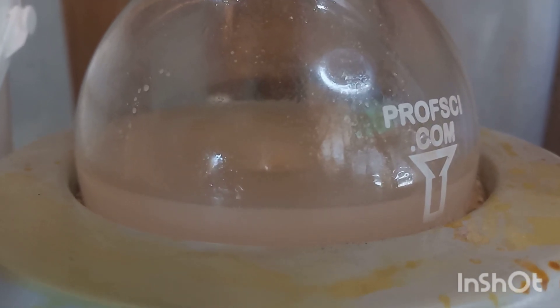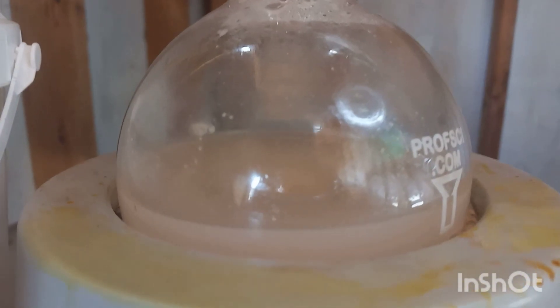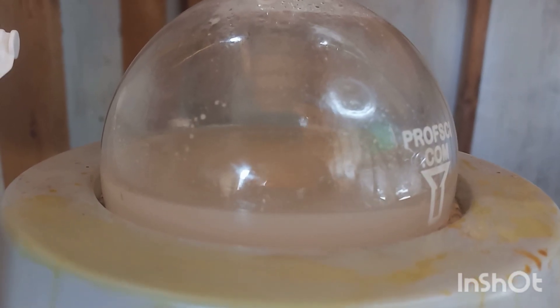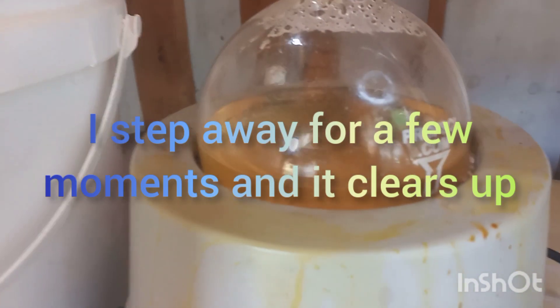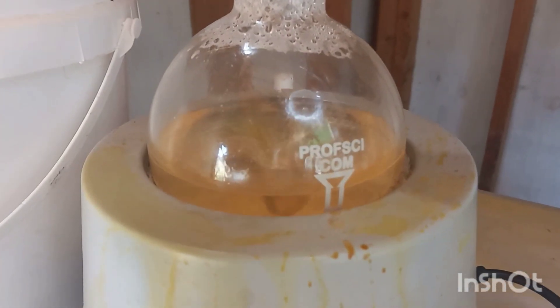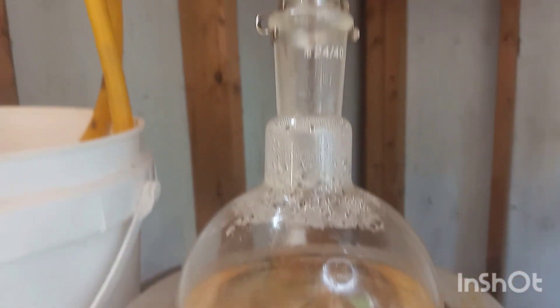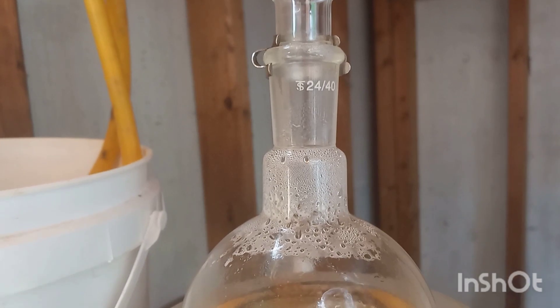We've got up to about 60 degrees. We're getting some reflux — it looks a little oily on the sides. It's very hard to tell, but we are getting a little bit of oily reflux.